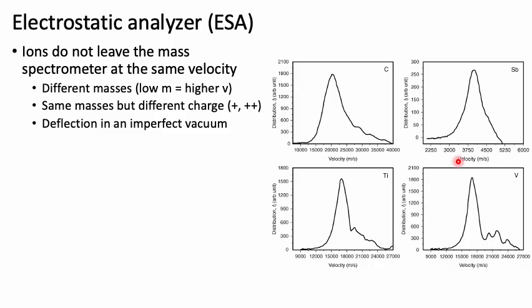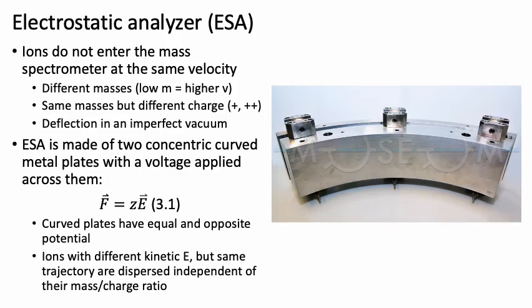And we have a main peak here that is the main isotope that is passing through and the velocity is being measured, but we see that there's a large tail on it, and those tails have other peaks of different particles or the same particle but with different velocities, right? And we want a single velocity in our material to come through. So how we do this is we apply an electrostatic analyzer.